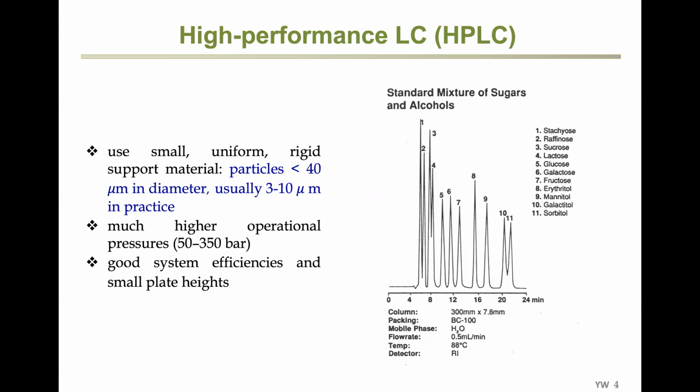And while you're designing a new protocol for analyzing a new sample, you will take all this into consideration, and you will probably have to try different combinations of those parameters to achieve the best performance. Okay.